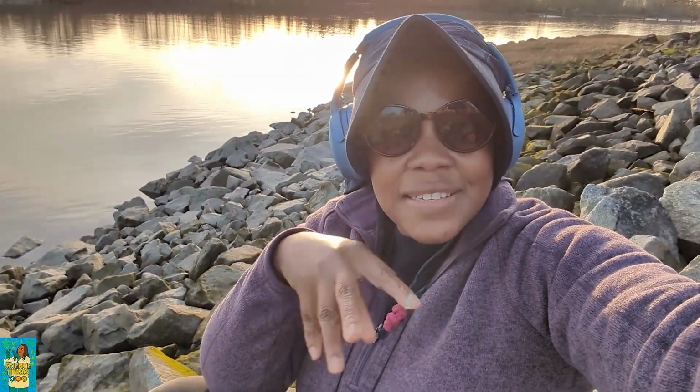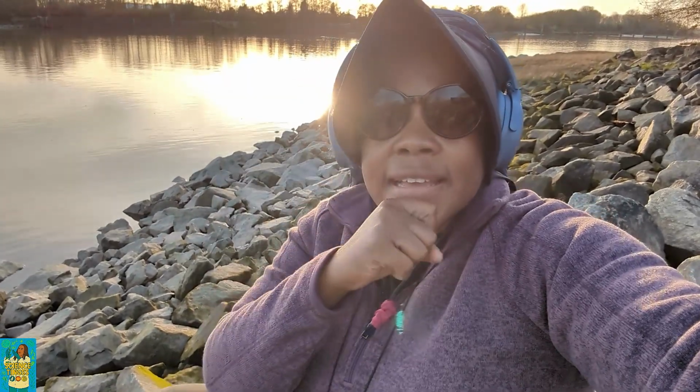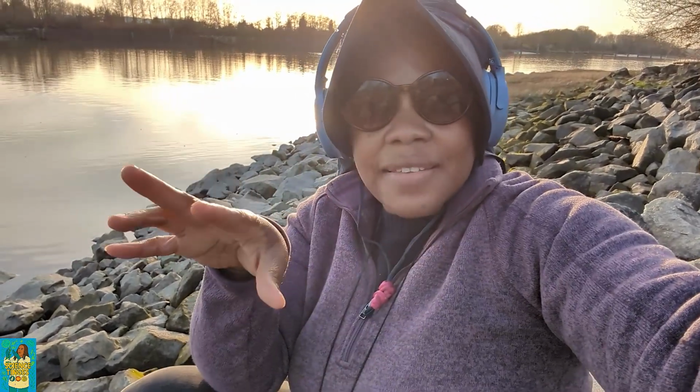Came here to find trees that, hi bird, seagull, geese, I don't know. Anyway, so I'm attempting to isolate this particular soil fungus, and it is one of the good or beneficial ones. Good slash beneficial, it depends on the context. Why this one is good slash beneficial is that in its interaction with plants, it doesn't cause disease. What it does is help the plant fight against pathogens, the ones that cause disease.